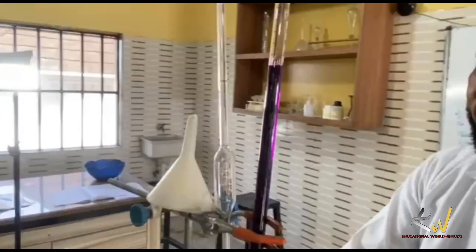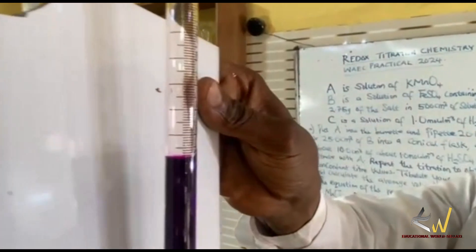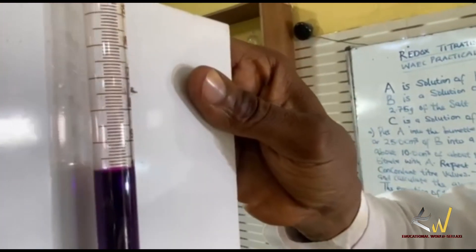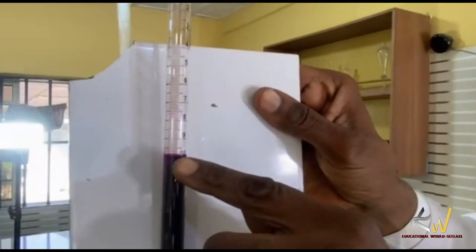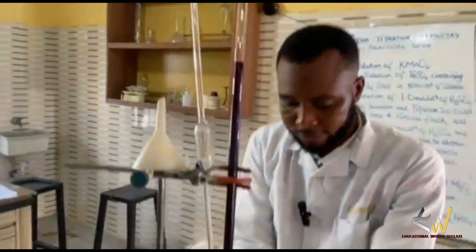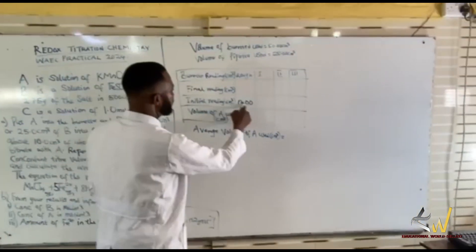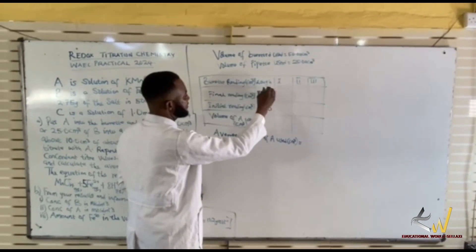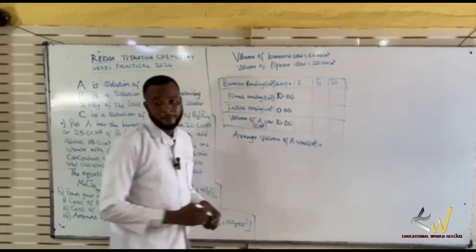All right, let's take our final reading. If you want to have a clear view, place a white tile behind it. It is 10. So it is 10. We started from 0.00, so you are getting 10 as the rough reading. I go to the board to record what I have seen: 0.00. Our final reading here is 10.